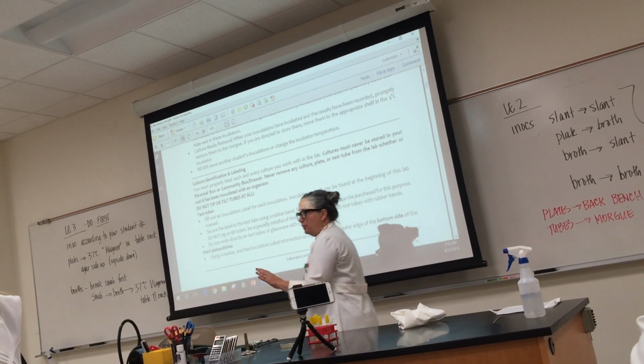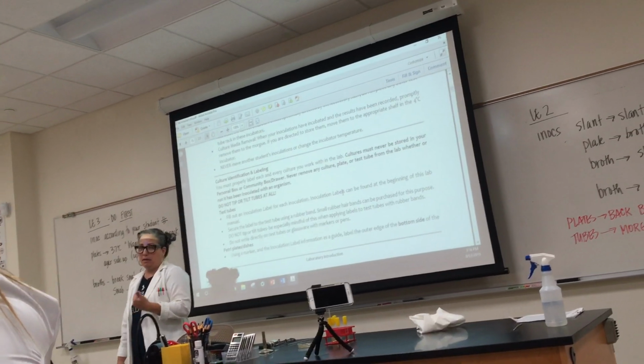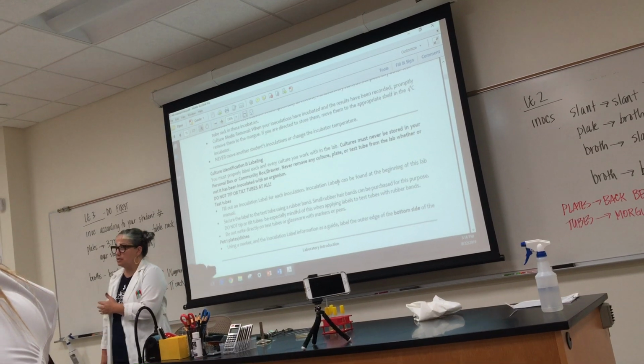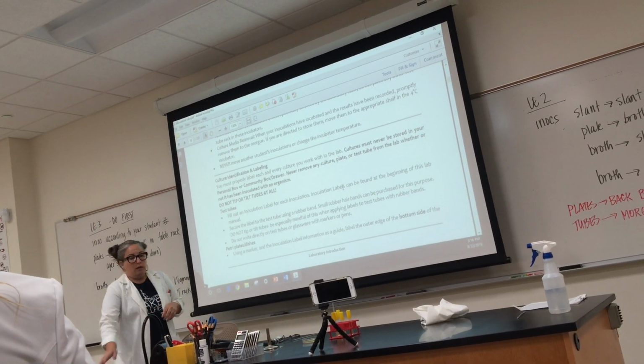Anything that is not labeled will get thrown away, and you will come in the next day looking for your stuff, and it won't be there because I will throw it away, because it is unsafe for us to keep anything that we don't know what it is, right? So make sure you do that.